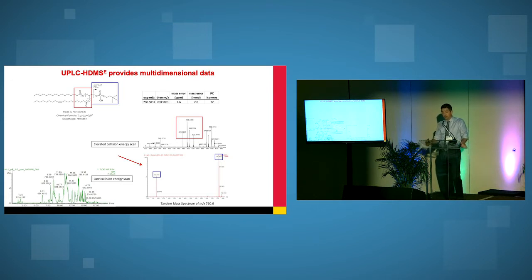The top chromatogram is just an extracted ion chromatogram of a master charge 184, which is characteristic of phosphocholine. We can interrogate the data further by pulling out a tandem mass spectrum. This is with the benefit of ion mobility. So we get, in this example, we get a fairly clear tandem mass spectrum. We can go through, we can annotate the peaks. We can look at accurate mass. We can get some structure information to get an idea of what the acyl chain lengths are. And there's some indication in terms of what the positions actually are. We can go in a little bit further and we can identify diagnostic product ions.